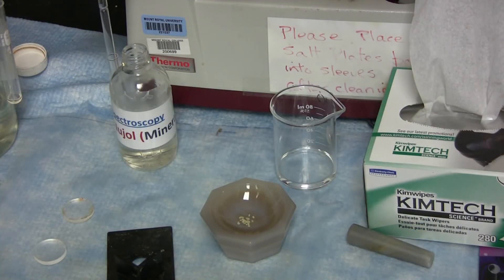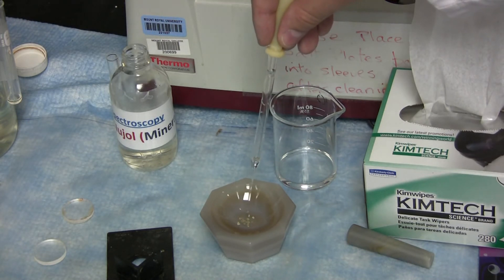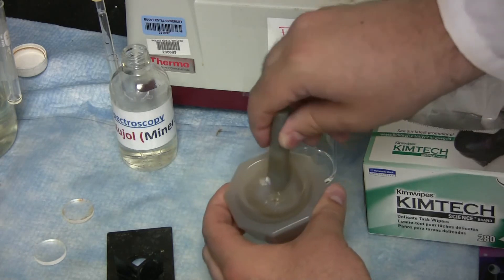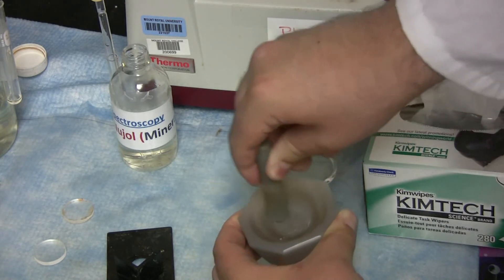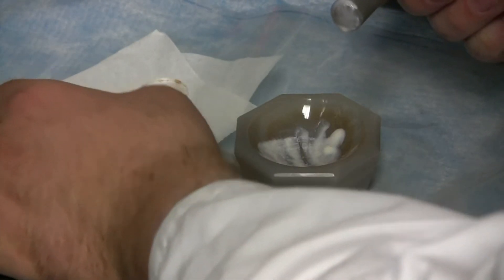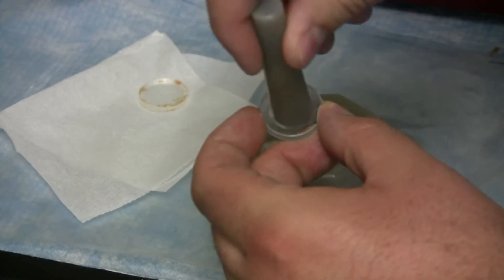Start off by adding your sample and then some Nujol to the quartz mortar. Then mull it into a paste. Once it's been mulled into a fine paste, use the pestle and smear some of your sample onto one of the clean salt plates.